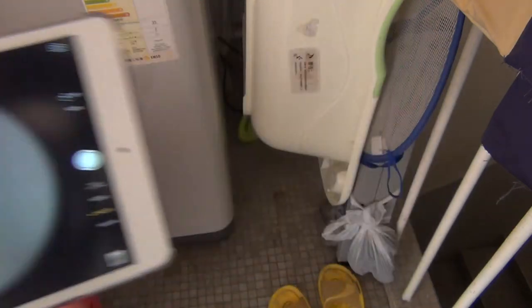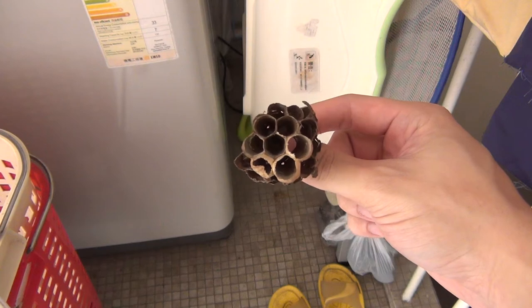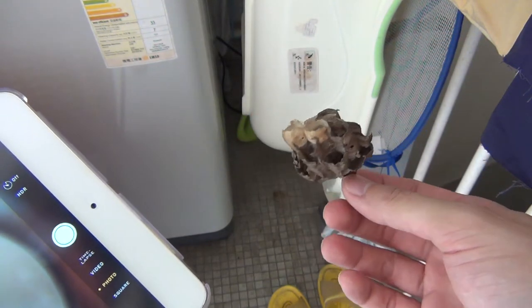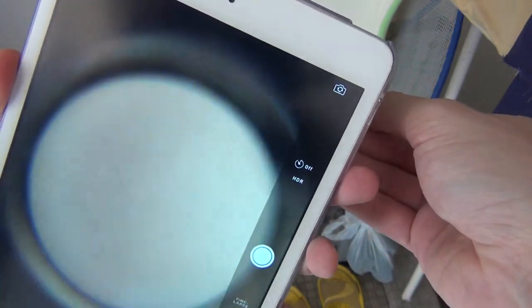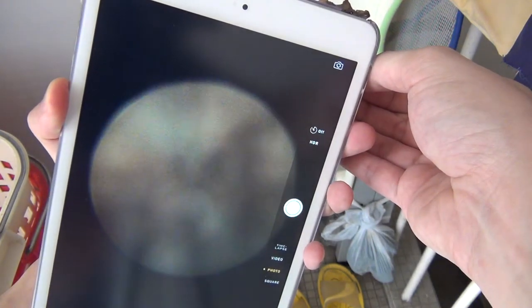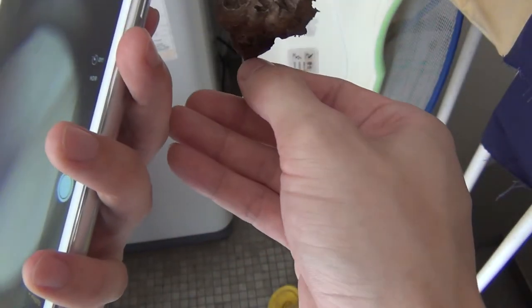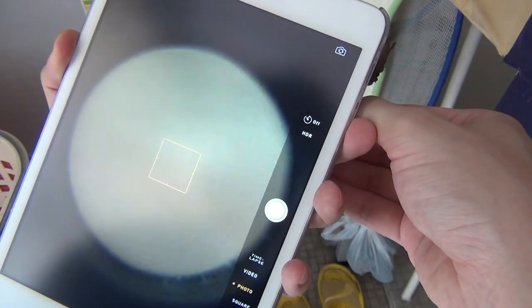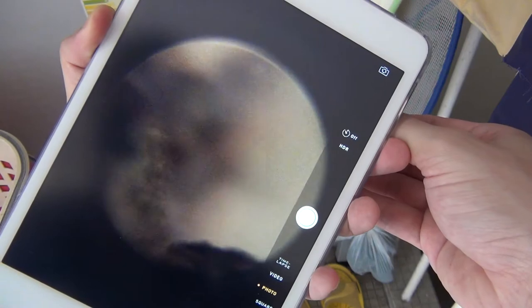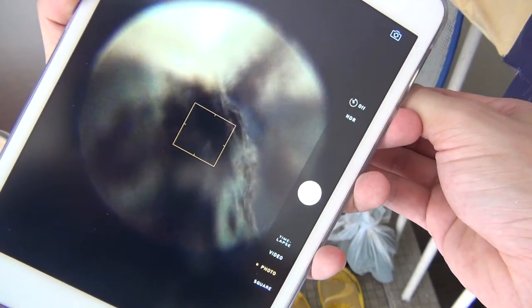I have something interesting to show you now — this. You see what this is? This is an abandoned paper wasp nest that I picked up a while ago. Let's look at this thing under the microscope and see if I can get stuff in focus. It's pretty hard because with two lenses like this, the object is almost touching the lens — you can't go much further.